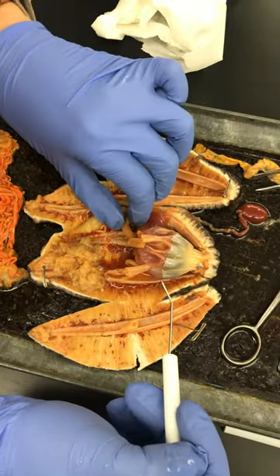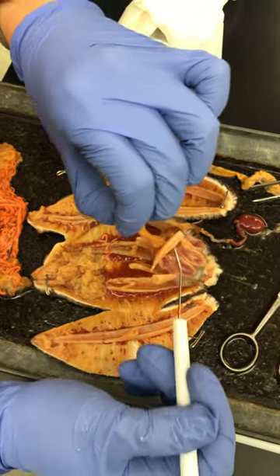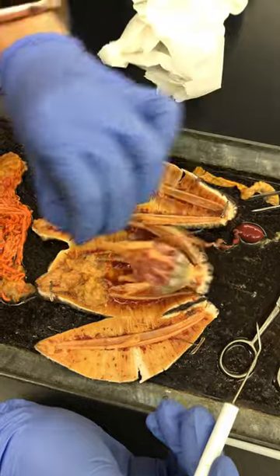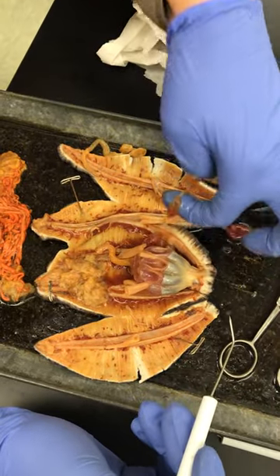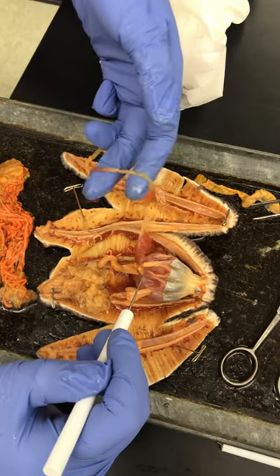These are the retractor muscles — I'm going to pick it up by the stomach. Retractor muscles, here. And then this is the polian vesicle. I don't know what it does. Quite interesting.